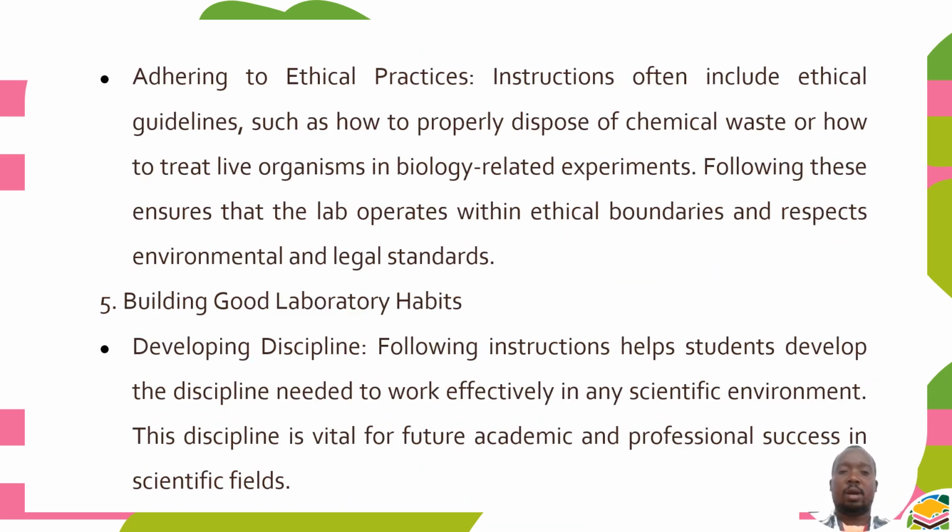Now, adhering to ethical practices, instructions often include ethical guidelines such as how to properly dispose of chemical waste, or how to treat live organisms in biology-related experiments. Following these ensures that the lab operates within ethical boundaries and respects environmental and legal standards.